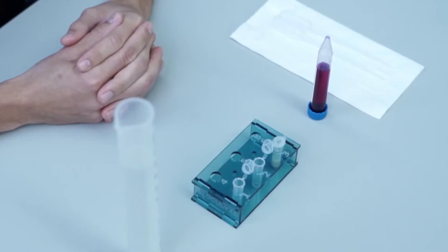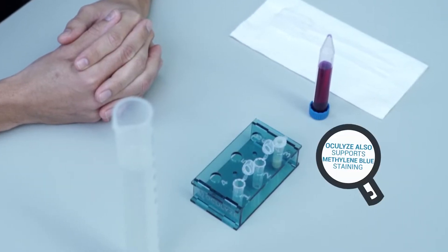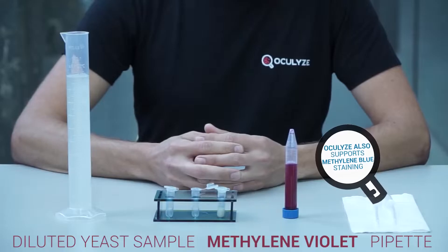In order to determine the viability of the yeast, it must be stained. We recommend using methylene violet. Here is what you'll need for staining.